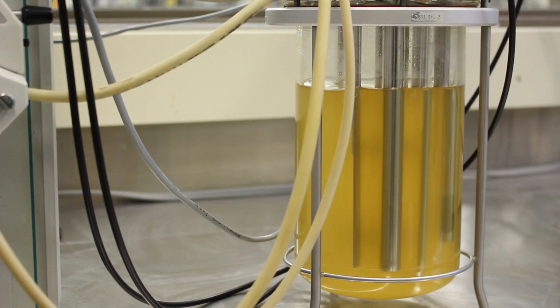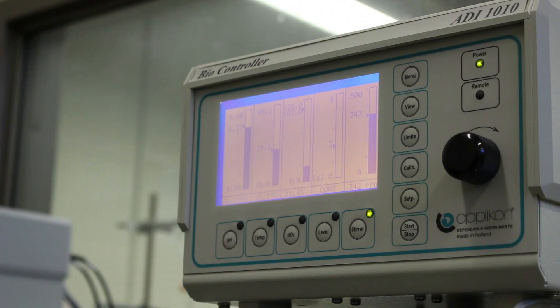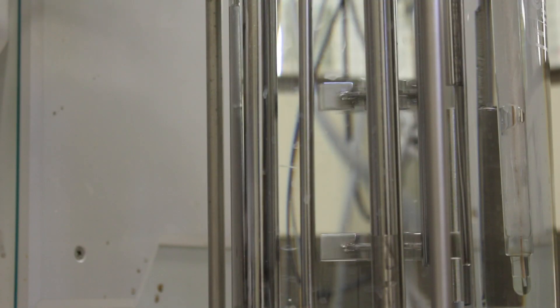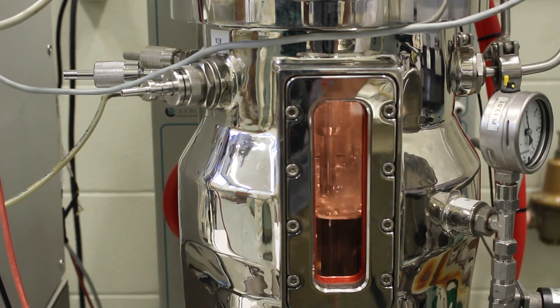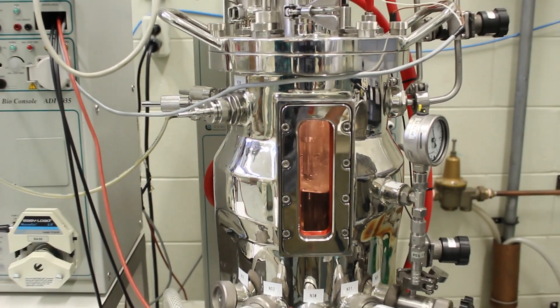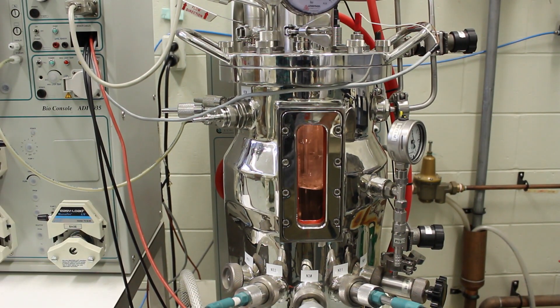Basically, you add all your components to the reactor vessel and turn it on. The controller determines which substances to add to it—your acids and bases—and ferments your product in there to create production of ethanol.